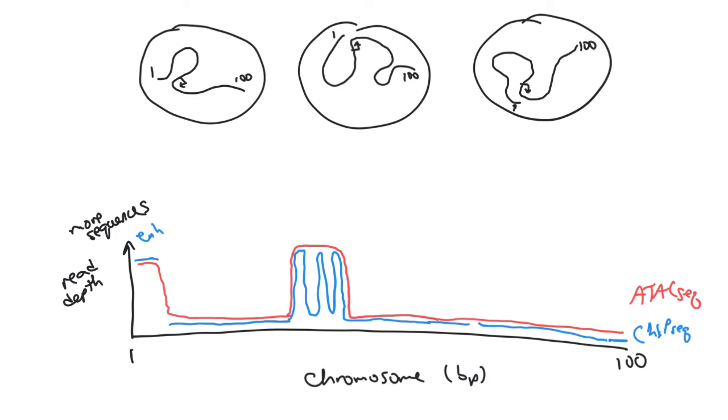Now it's the 3C-seq, or 4C-seq rather, that's looking for the chromatin conformation, the three-dimensional associations where we would see that peak in that one random nucleus where there would happen to be a rare three-dimensional structure of the chromosome that brought two regions of the chromosome together that weren't a gene and a regulatory region.